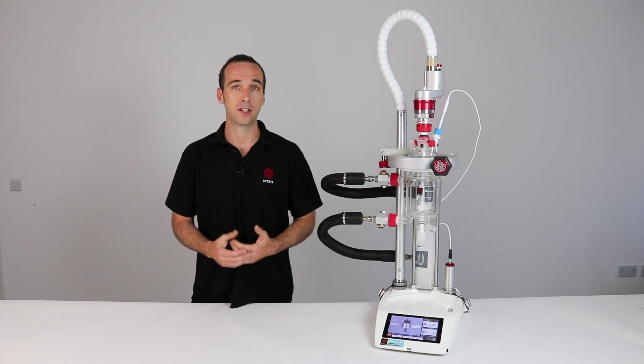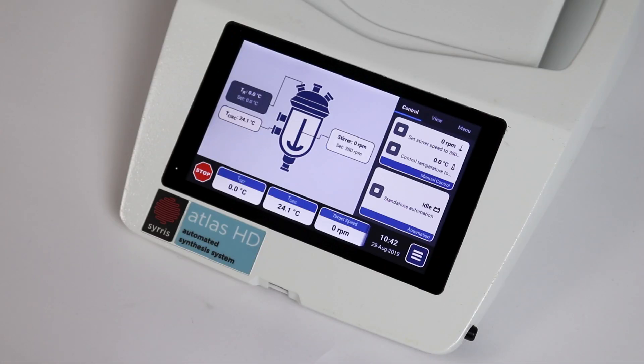All these features allow automated processes to be run and monitored in a seamless and optimized manner. When you first power on your Atlas HD system, you'll be shown a schematic of your reactor and connected hardware showing live data for all attached hardware.